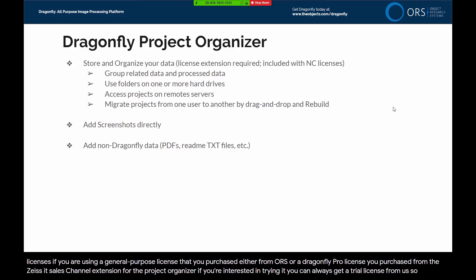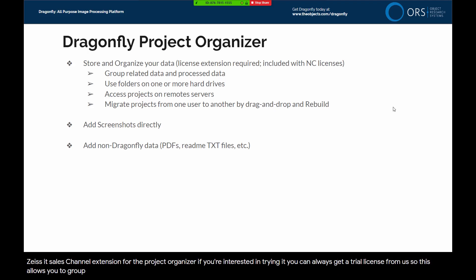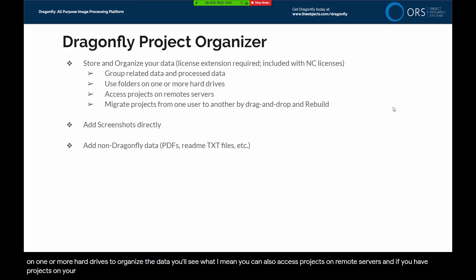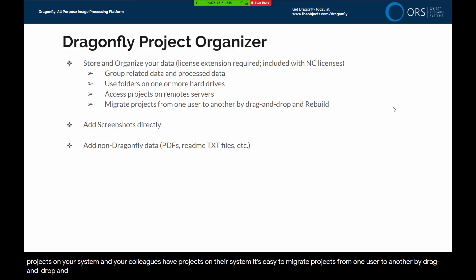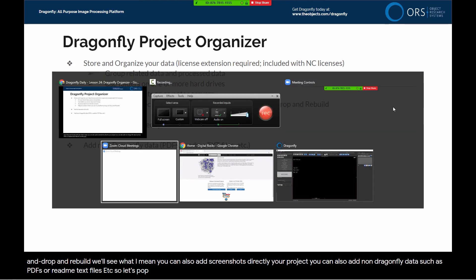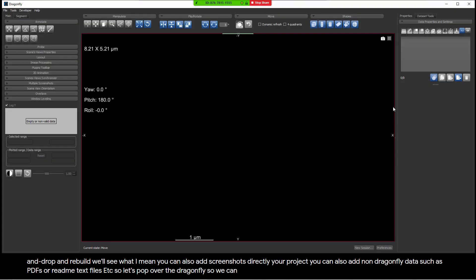This allows you to group related data and process data so that it's easy to find and organize the work you are carrying out. You're able to use folders on one or more hard drives to organize the data. You can also access projects on remote servers. If you have projects on your system and your colleagues have projects on their system, it's easy to migrate projects from one user to another by drag and drop and rebuild. You can also add screenshots directly to your project, and you can also add non-Dragonfly data such as PDFs or readme text files.